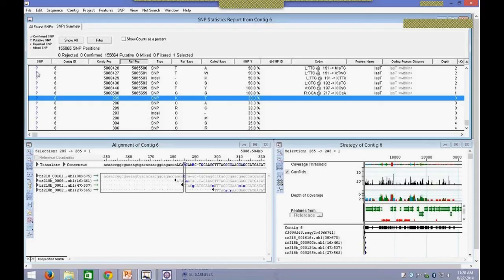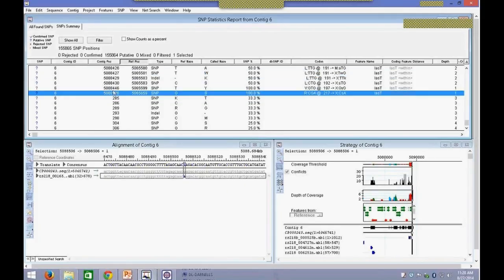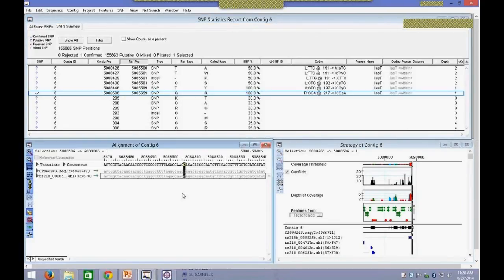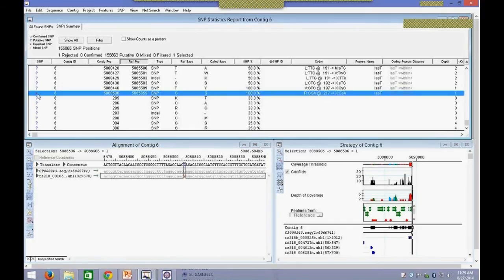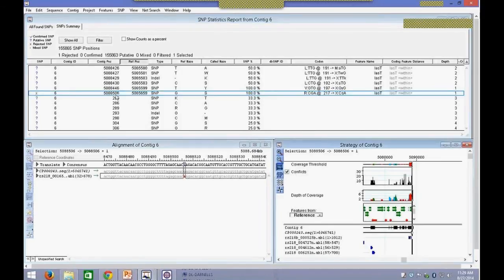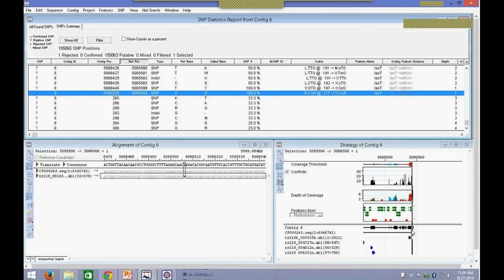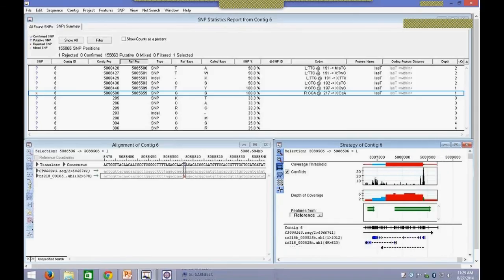You can choose to hide or show columns by right-clicking in the gray area and going into Show/Hide Columns, and then uncheck the columns you do not wish to see. The SNP column has question marks, which means there's a putative SNP found. You can go into any one of these areas and confirm or reject a SNP. If you click the question mark once, it will turn to a check mark, and in the actual alignment view you can see it will be turned to green. As you're confirming your SNPs, your reference sequence is being auto-annotated, and then you can use that reference sequence for future assemblies. If you click once more, it will reject your SNP and it will turn to red.